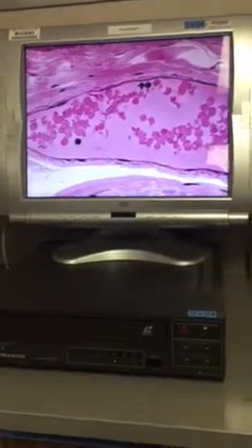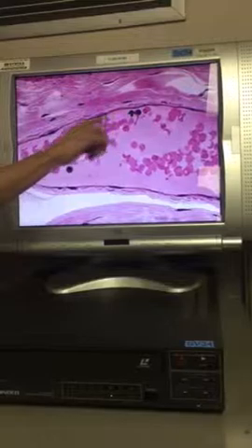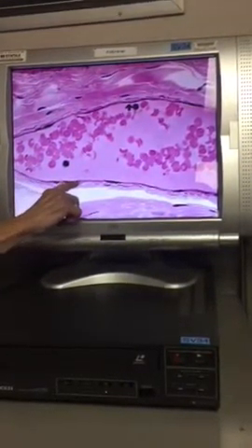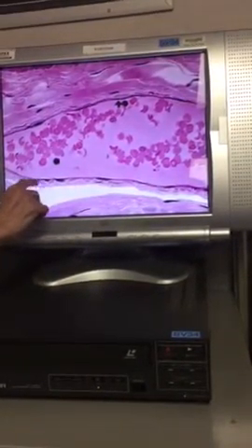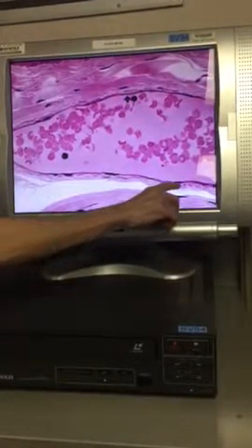So this is a blood vessel. I know it looks gigantic, but it's magnified, of course. So notice that the lining is this thin line. Okay, so this is the tissue that we're talking about. You can just ignore these other layers in the wall. This is simple squamous epithelium. You see the nuclei of the squamous cells here.